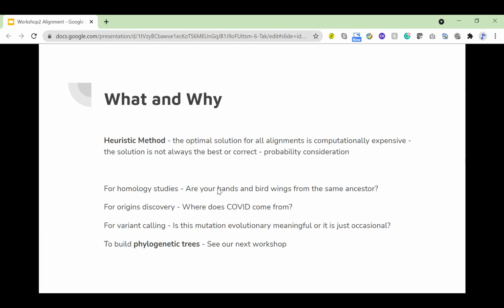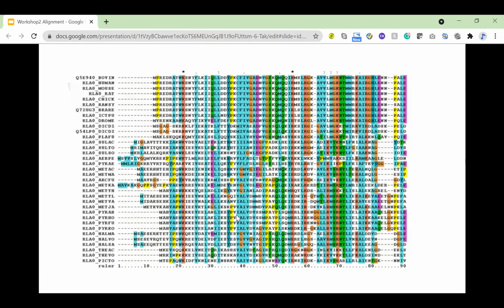At least it's some real application that you can use. This is just a picture to demonstrate the outcome of it. You can see they're all color coded, and there are a lot of similar regions, and a lot of variants. These small variants may tell you something biologically, and those conserved areas may also tell you something. This is actually a good demonstration.